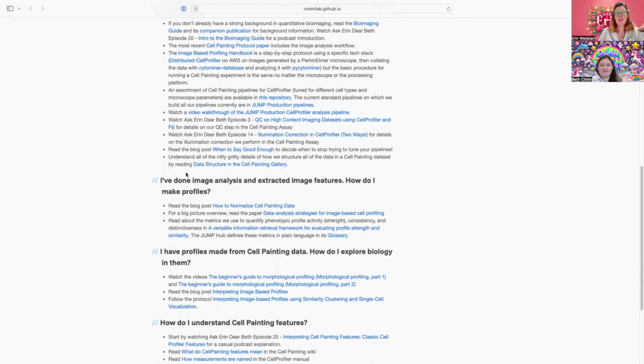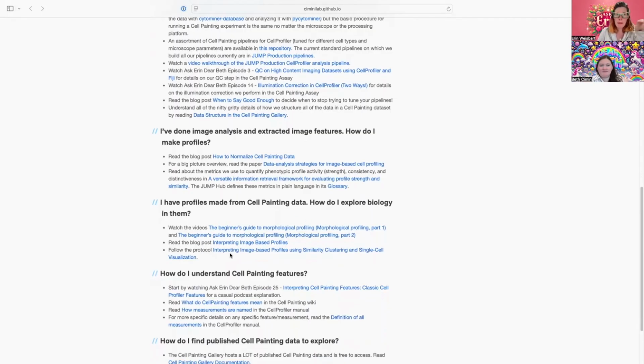If you have a biological question, you could just jump into pulling profiles from a data set that somebody else has made, and start exploring the biology, because for sure there is unexplored biology in all of these published data sets. While the researchers that initially made them may have found something interesting, there was guaranteed to be a whole lot more in each of these data sets that is unexplored and also exciting and valuable to other researchers.